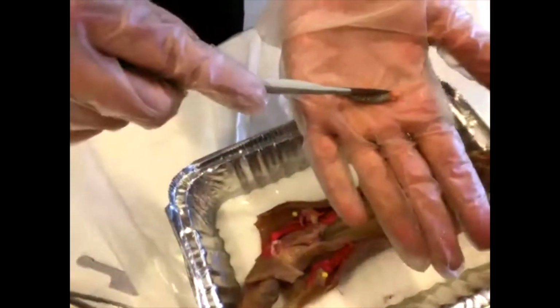And we can use the ink sac, which I'll get again. You can open the ink sac, and you can dip your, see that? See how inky that is? Like my scalp gets covered. You can dip your pen right into it, and there it is. There's some ink.